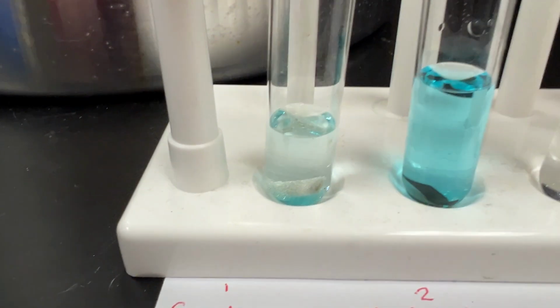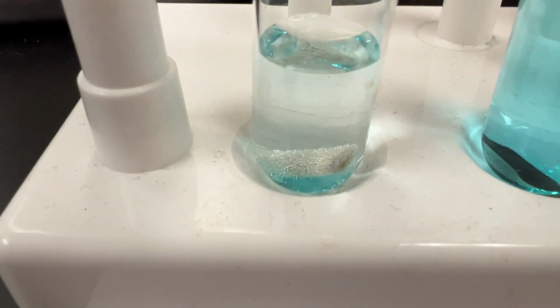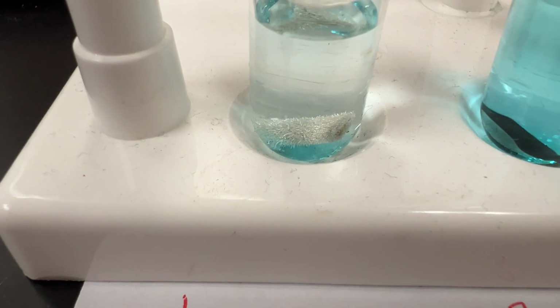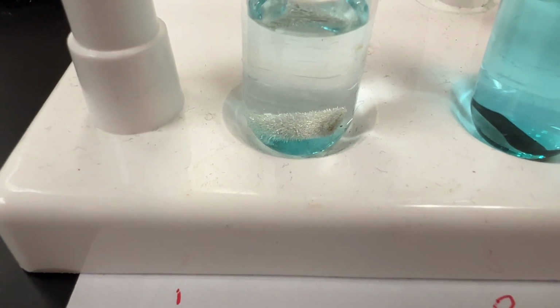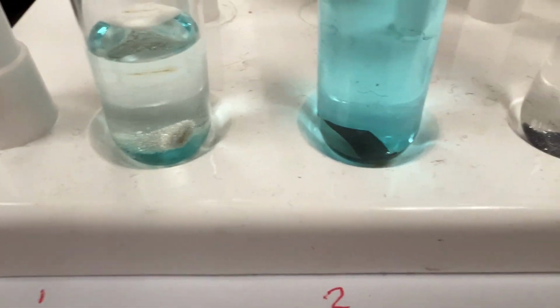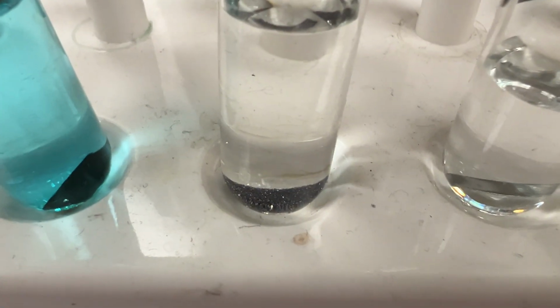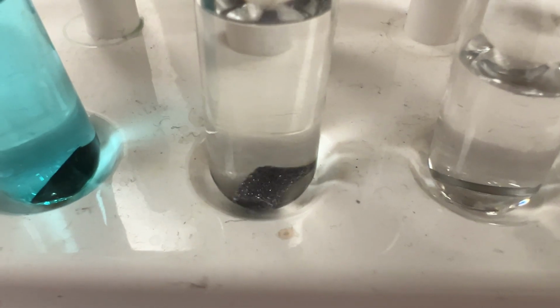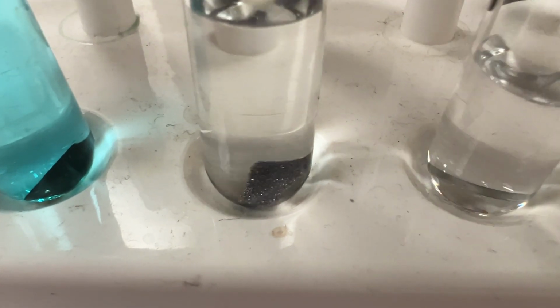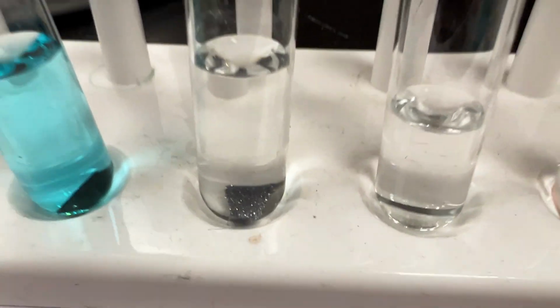Let's go ahead and take a look at this side, the ones that I put in a little bit later. Again, very pretty silver crystals. You can see they're spiky and shiny. And what does our zinc and lead nitrate look like? Ooh, so sparkly and shiny. I love it. Those are my favorite 2 reactions, which is why I'm spending a little bit more time on them.